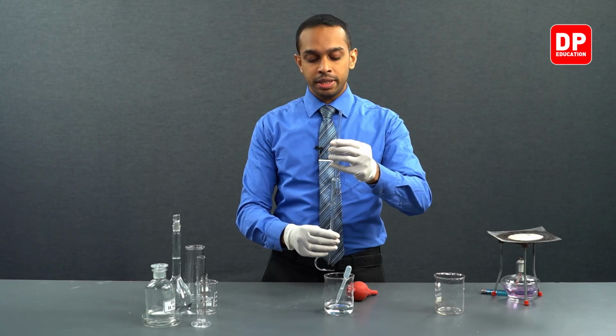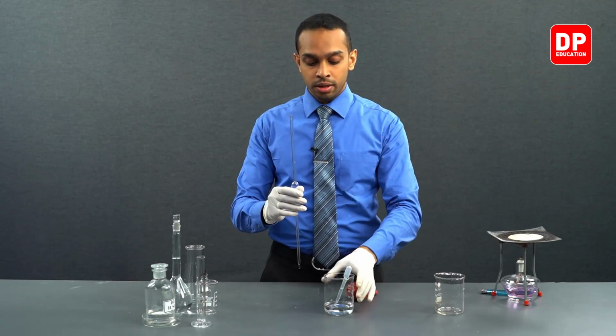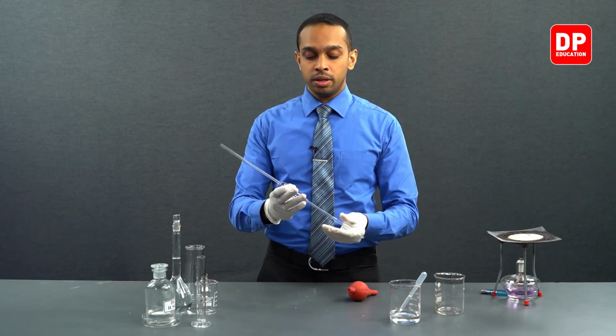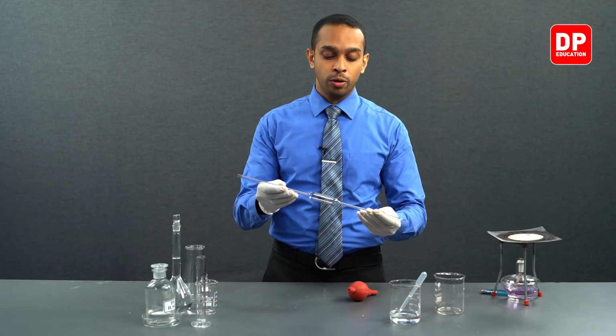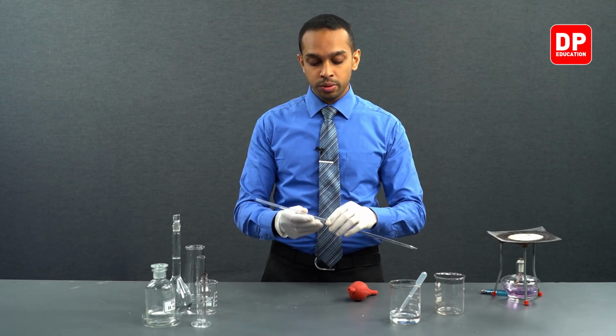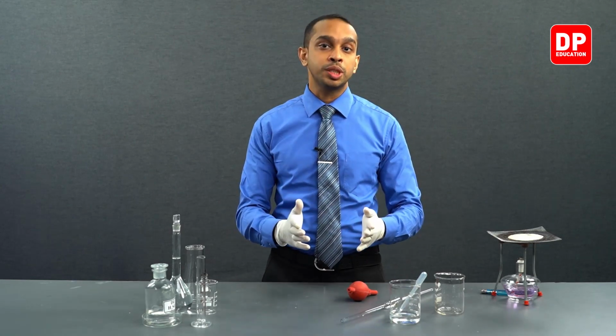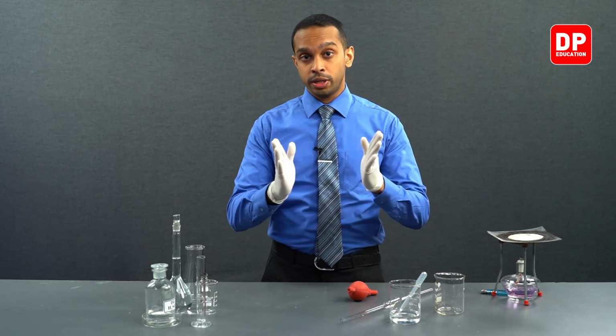Now I have taken distilled water into the pipette once and let it out, making sure that I have washed the interior walls of the pipette with distilled water. All that is left for me to do now is to wash it with our potassium oxalate solution.